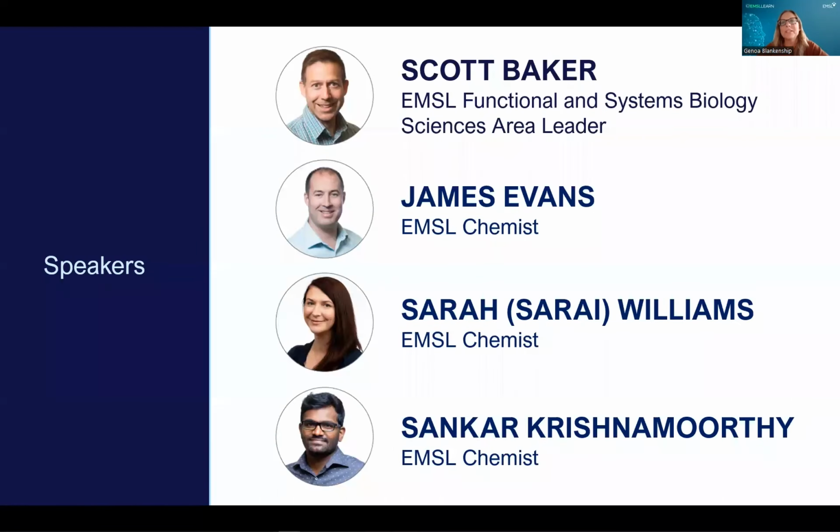Today, we have Scott Baker up first. He's going to be walking through those two upcoming calls for proposals, including timelines and important information that you're going to need to know about. James Evans will follow. He's going to be demonstrating how to use nanotomography for generating 3D representations of cells. Sarai Williams will also be speaking. She's going to be providing details on using EMSL's popular small-scale automated sample analysis workflows, including nanoPOTs for proteomic analysis.